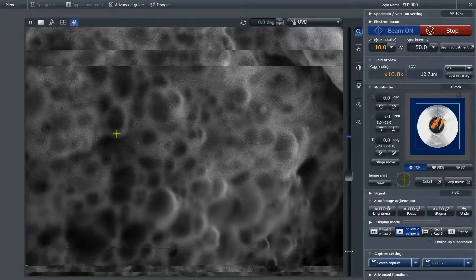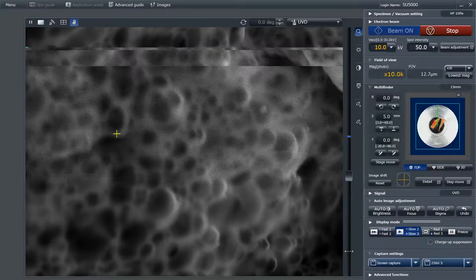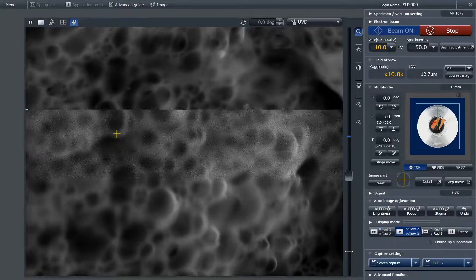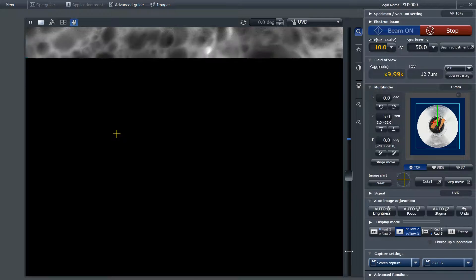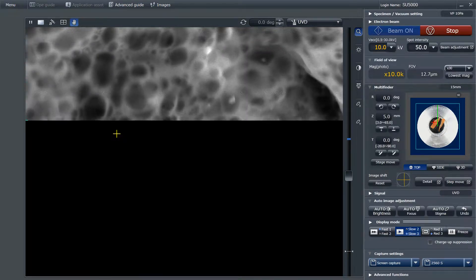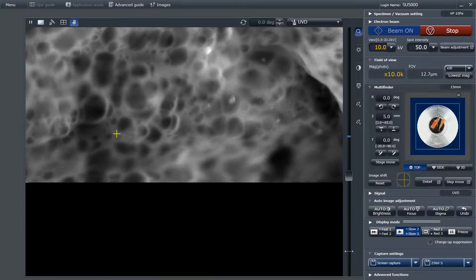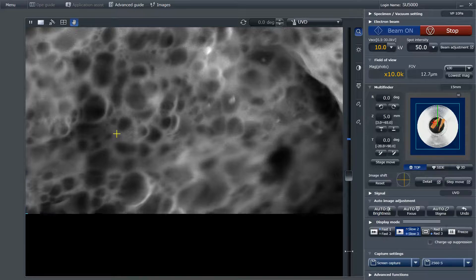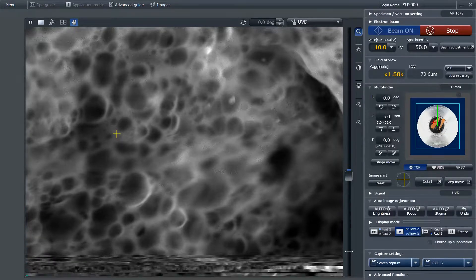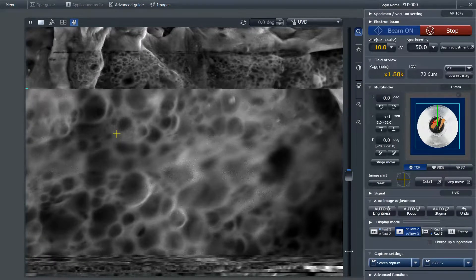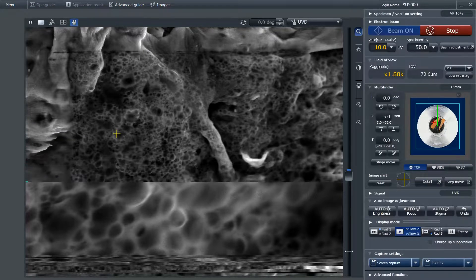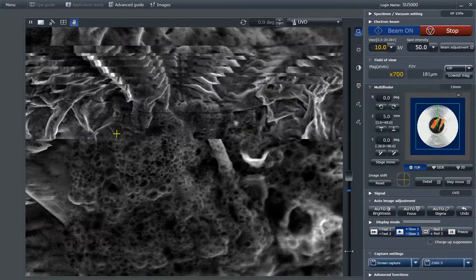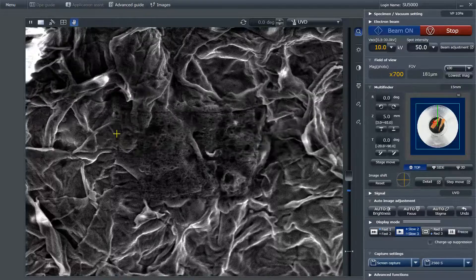As you can see the image quality is not optimal. And now zooming out, you're able to see the square which we were looking at earlier.